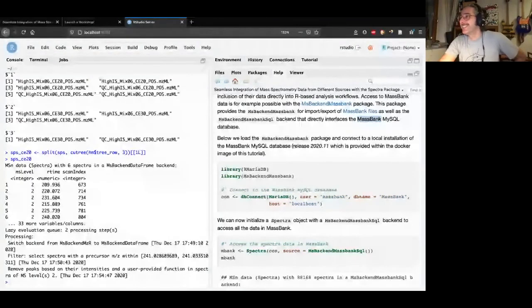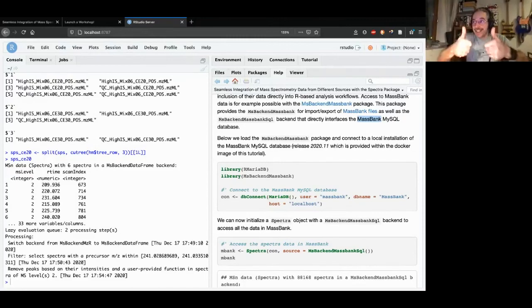There is a question from Tobias Kochman. He asks, what is the status quo of the chromatogram package? How will it interact with the Spectra package? Good question. We have a sticker for the chromatogram package, and we also started implementing it.